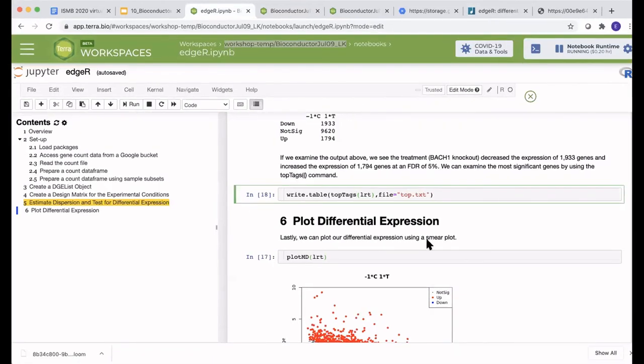Yes, thanks. Great. Write table has a parameter so that you will not put quotes on each value, which is a bit annoying. So if you write help write table, then it says what the parameter is. Okay.